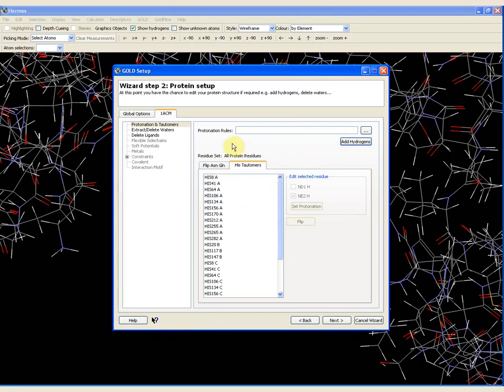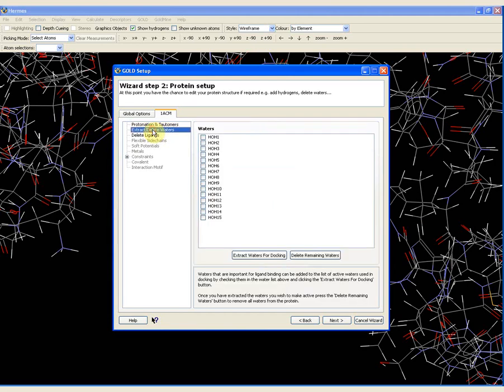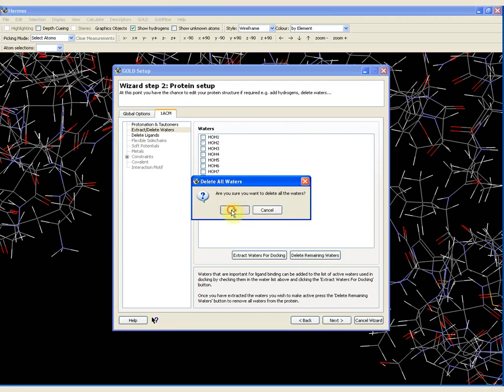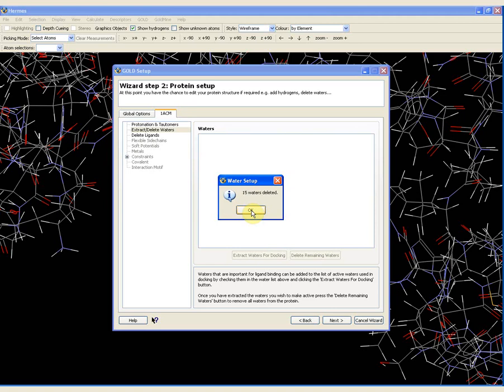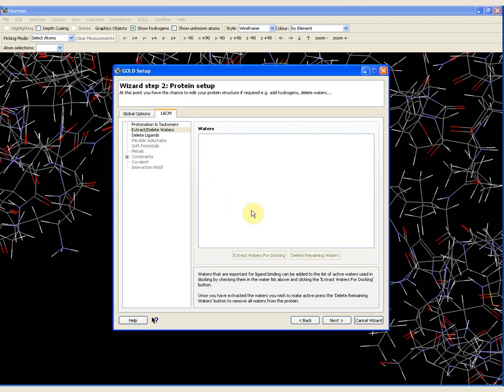I press OK. I then need to deal with the water molecules, so I go to the second option — extract/delete water molecules. Because none of the water molecules in this case are mediating any interactions between the ligand and the protein, I can delete all of them. I select 'delete remaining waters' and click OK. It tells me that 15 water molecules have been deleted.